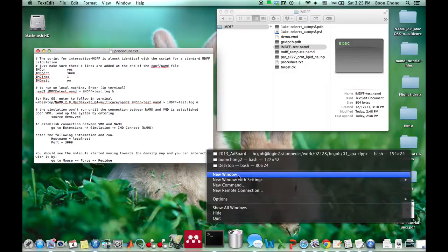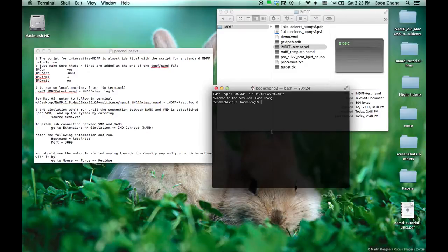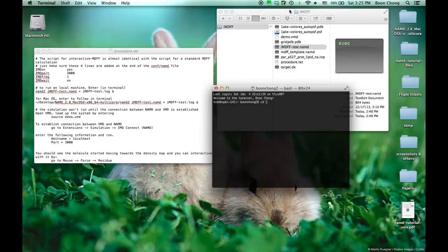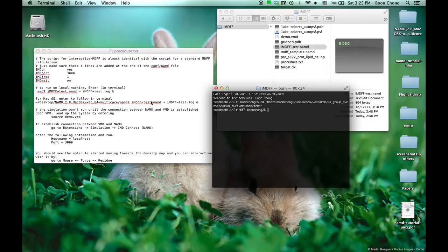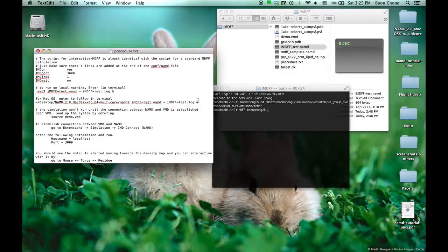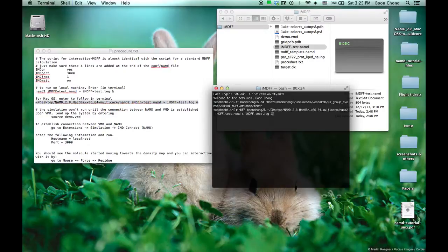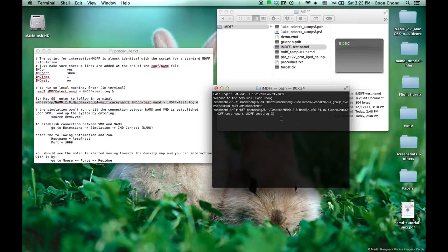To do it, we just go to the place that we want, tell the computer where the NAMD file is, and then we run as if we're running a standard MDFF calculation.